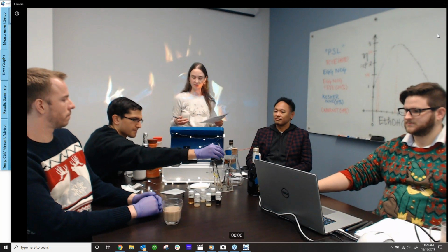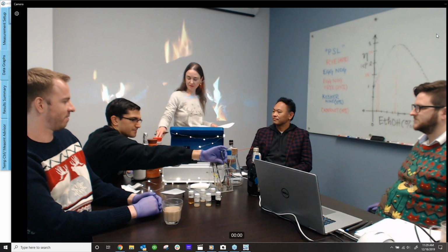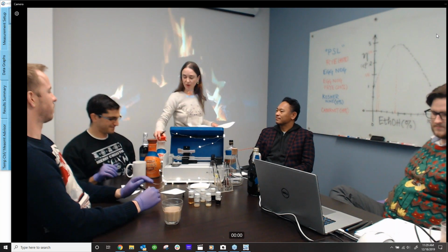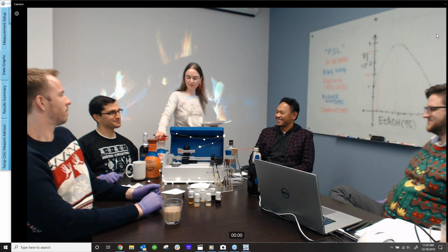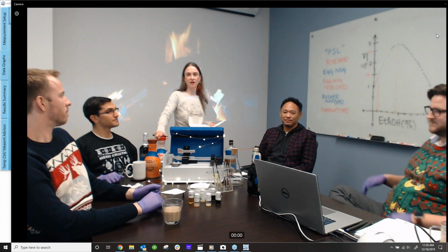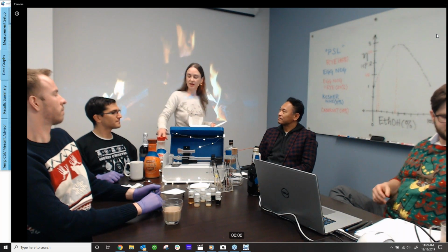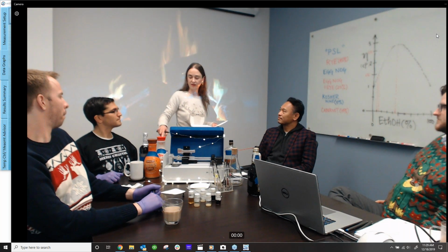Because many of our beverages had some alcohol in them, and then also our nogs are, unfortunately, not homemade pure products. They're commercially manufactured, so that means they're going to have some thickeners in them. So there's going to be some high molecular weight edible polymers like locust bean gum, something of the sort. So you have some interesting ingredients that you want to think about also in this type of sample.